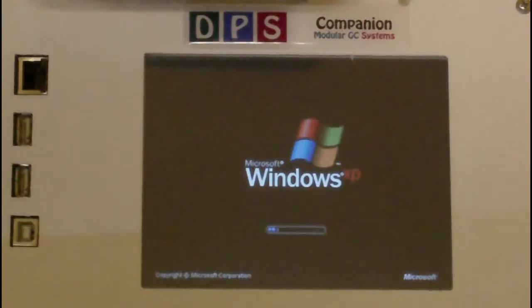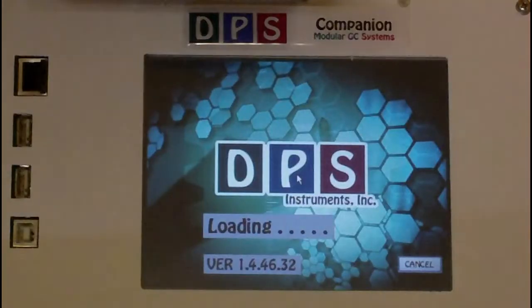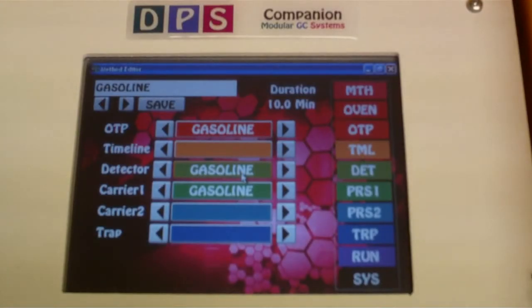Loading all the software takes about 1 minute. The DPS software always loads the method that was last run.